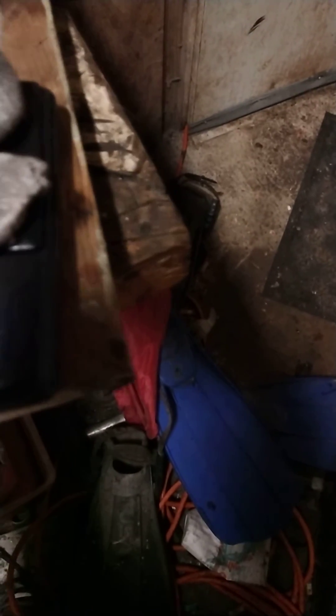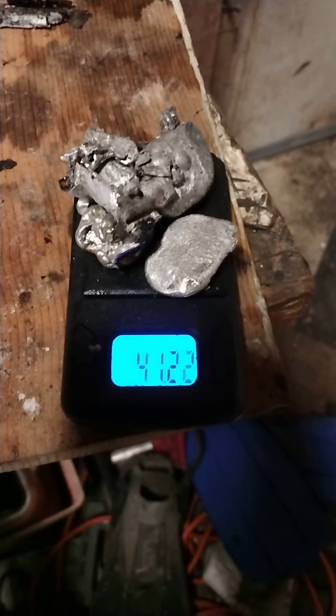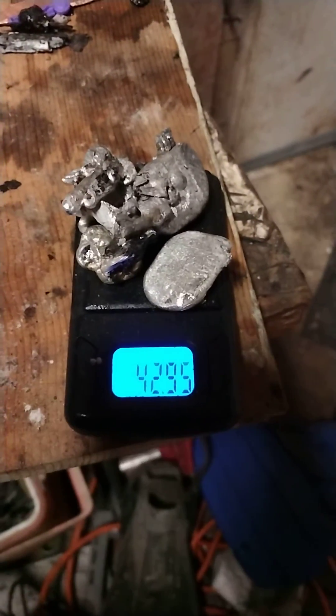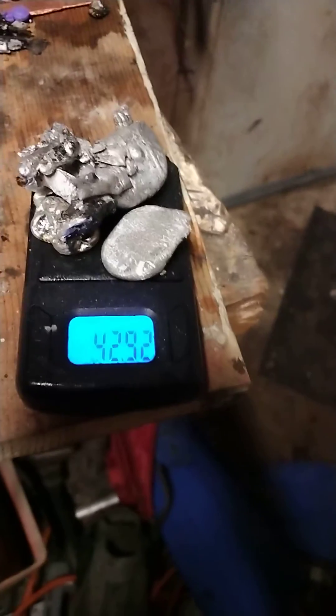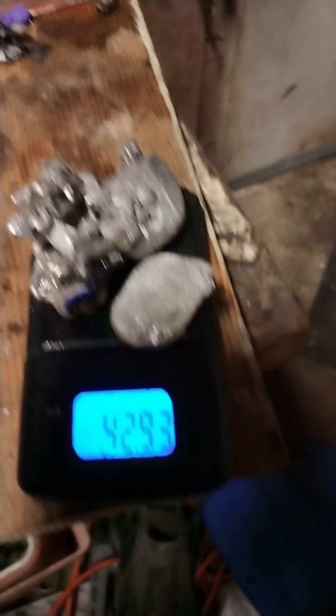She doesn't hate me now, though, when I brought this in there. I'm going to run it one more time, and that's 43 grams right there — 43 grams, absolutely pure. There is nothing else in it.